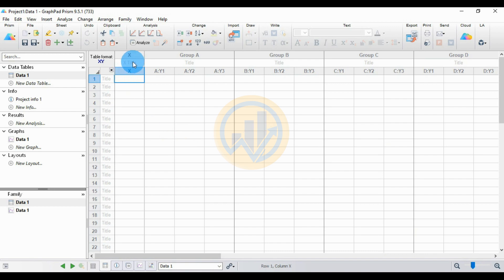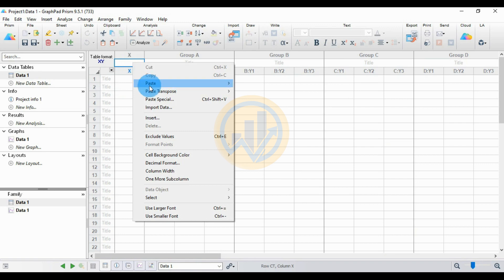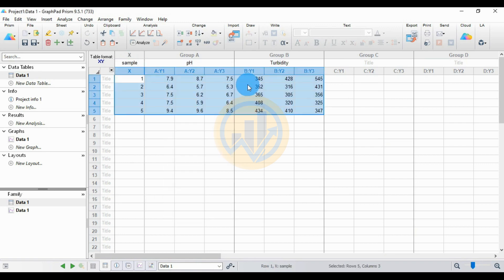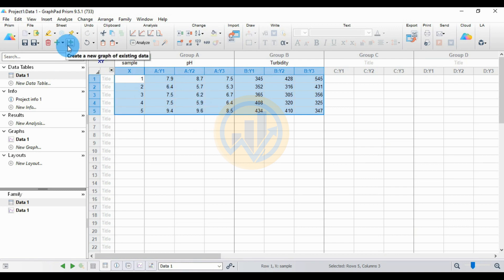Select the X-axis title column, right-click using the mouse, and paste the data. Our data is now pasted. Now create a new graph — choose the option to create a new graph from existing data and click this button.